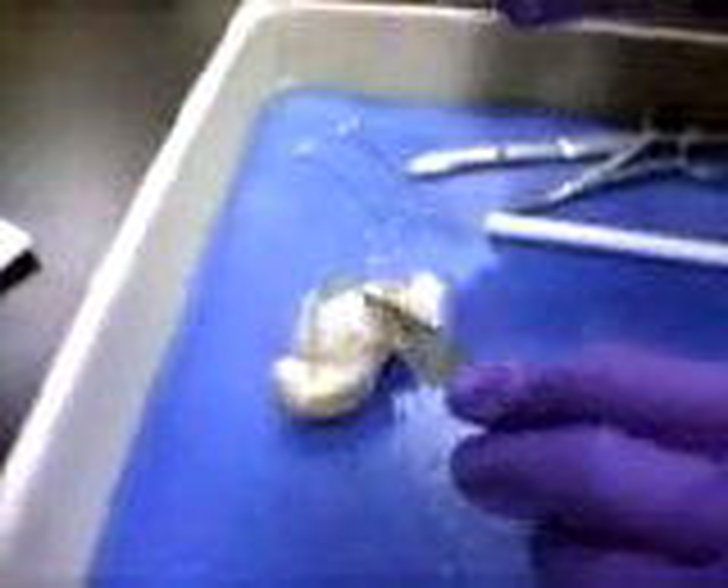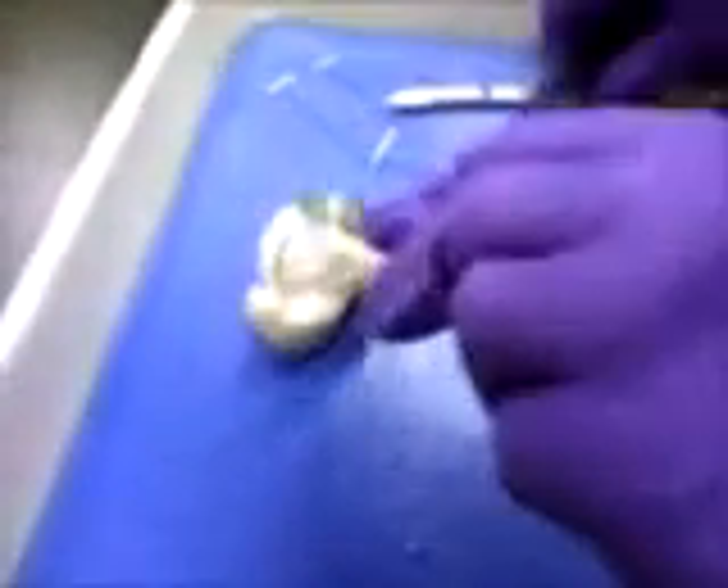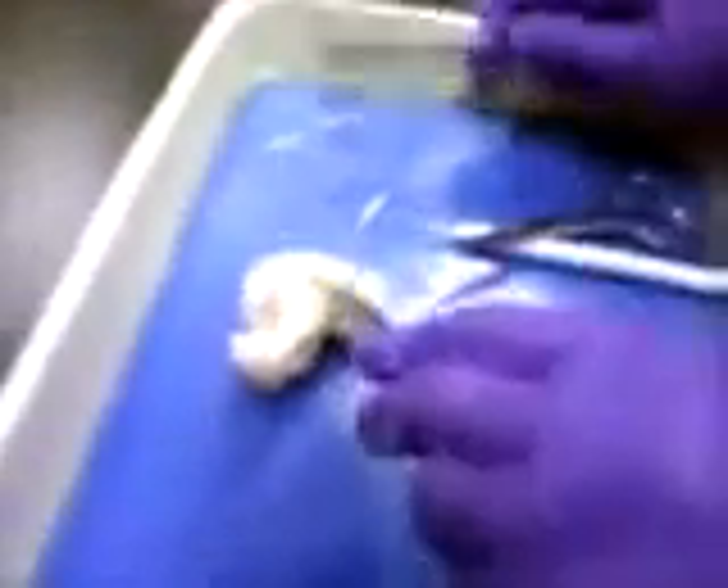Just stab it, like here, to get all the water out. Oh my God. Don't hit my book. Okay, you cut it.